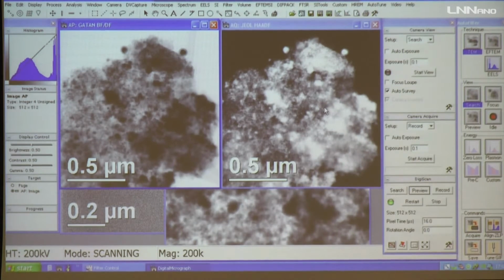When you have a large path for the electrons through the material, they will scatter and scatter, and then you may have a lot of brightness that perhaps is not related exactly with the presence of particles, but with a very long path inside the material.